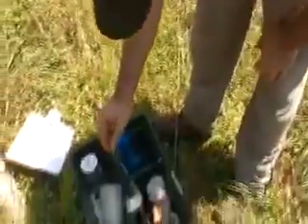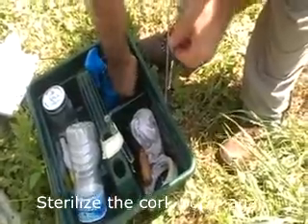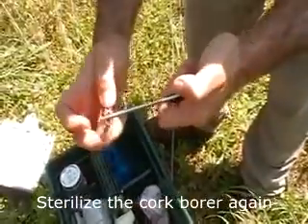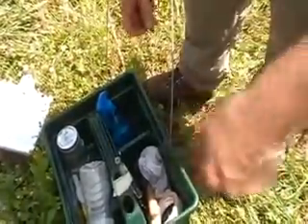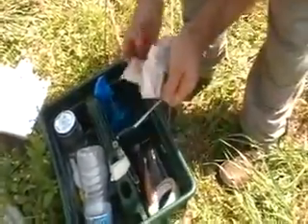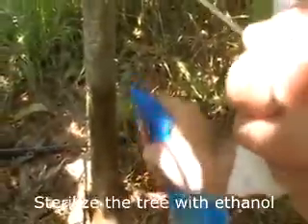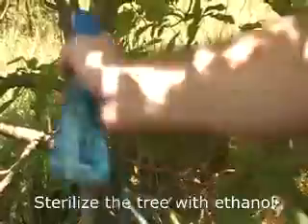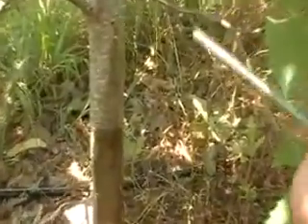Before we punch holes in the tree we need to sterilize the cork borer. This is a number one cork borer that I'm flaming with ethanol. Come over here to the tree. This is diluted ethanol, 50%, and we want to rub it just like you're getting a shot at the doctor.